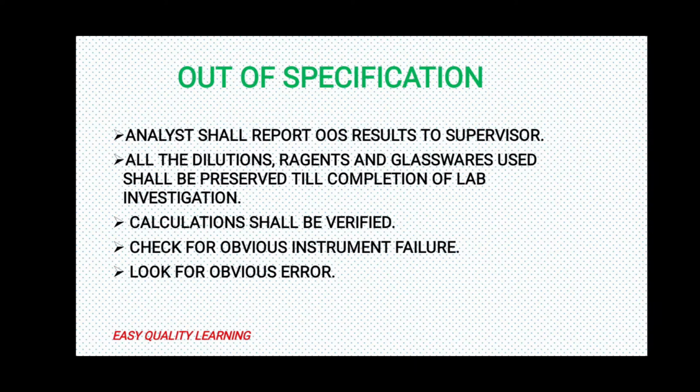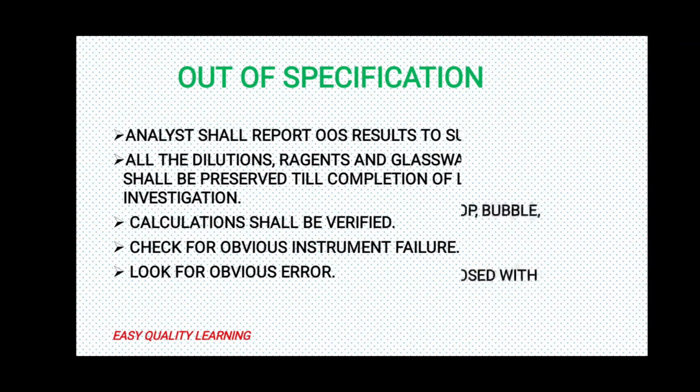Check the obvious instrument failure and look for obvious error. Nowadays, it is expected that unless and until your analysis is completed, your results are out, and you are assured that your results are correct, whatever the glasswares, reagents and dilutions you have used should be preserved till the end of your result completion.